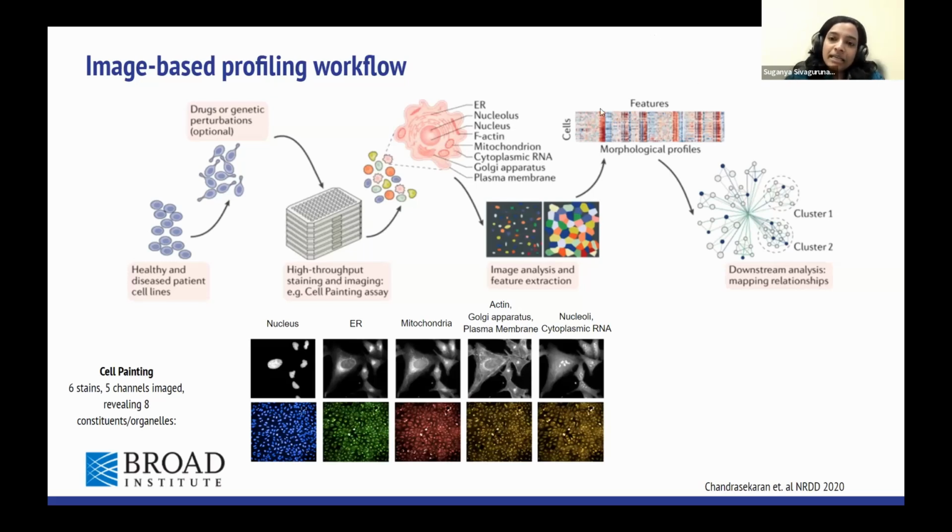Once you have this heat map, it is easier to understand the pattern that is going on based on the perturbations. With the information that you obtain, you can then cluster to see if there is a pattern in the phenotypic changes in the perturbations, or how dissimilar or similar the perturbations are to the controls.